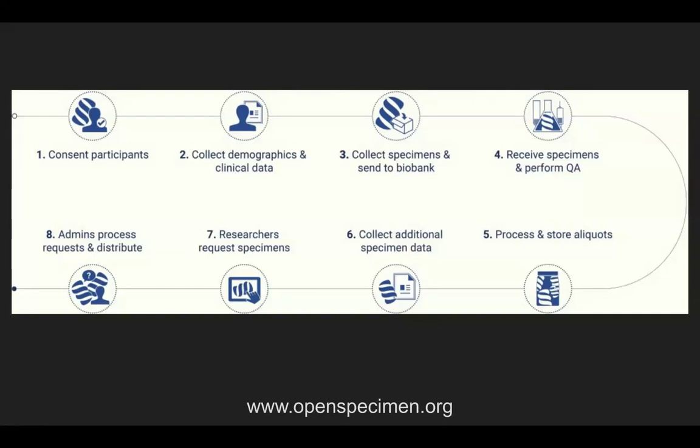And also collecting additional data. So if you're running tests on those specimens, for example, a NanoDrop test or centrifugation, etc., you can track all those things. How many times did you freeze-thaw? All those things can be tracked in OpenSpecimen.